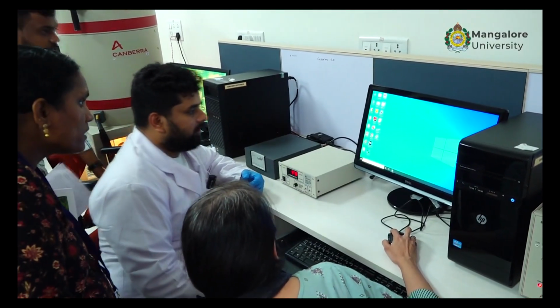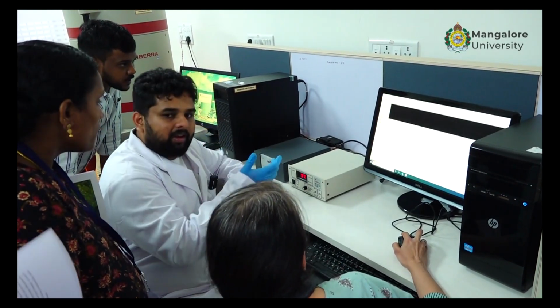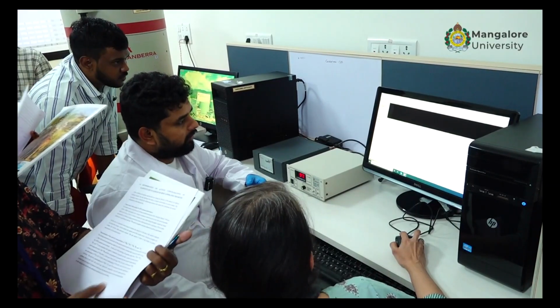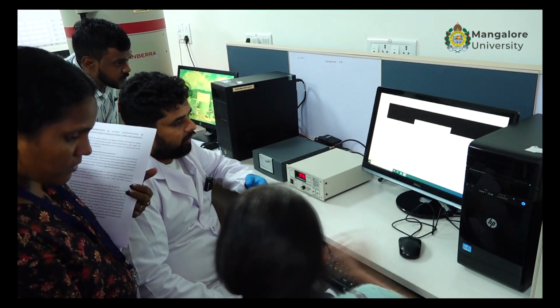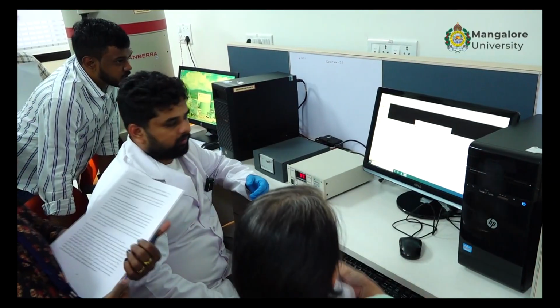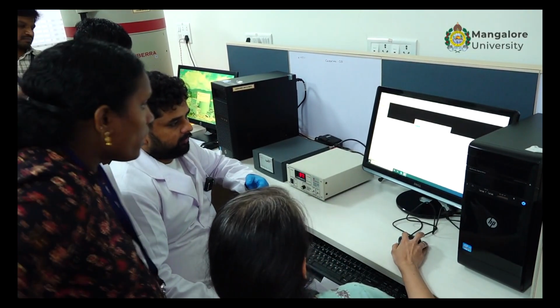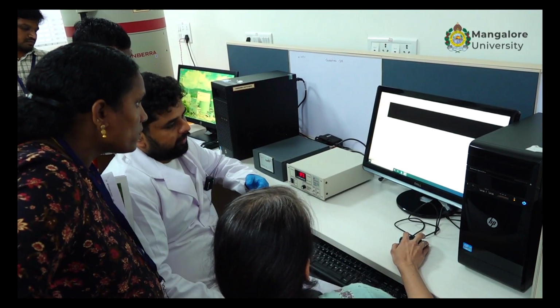This gamma acquisition. Yes, Gamma acquisition. Yeah, we have renamed this title as such. Okay, now open data source. Yeah, Detector. Yes, and now select the detector. There is only one. It's detected. Then click open. So the detector is open now.